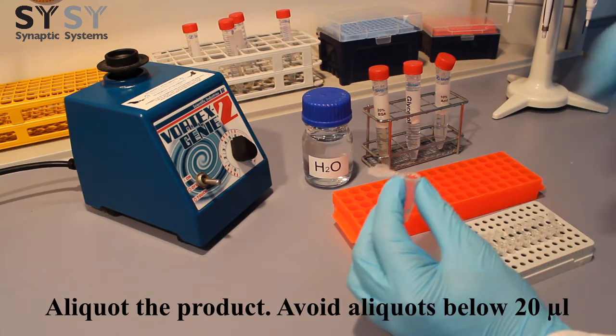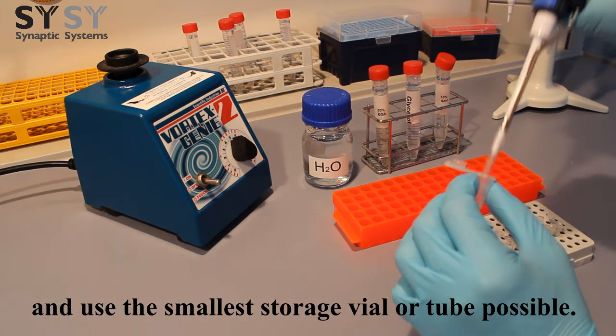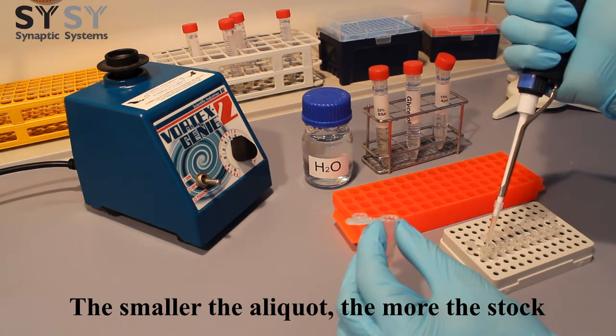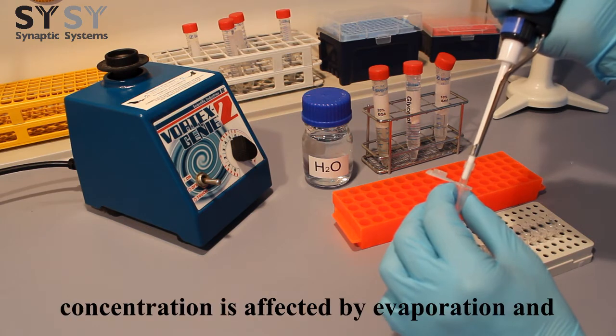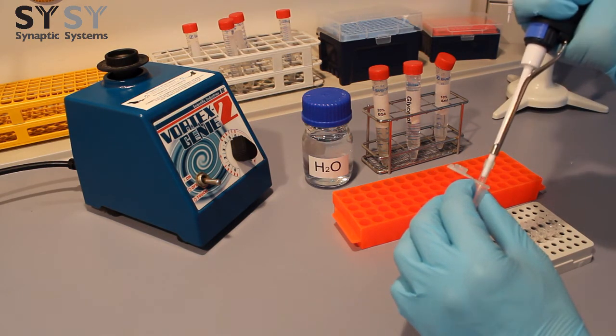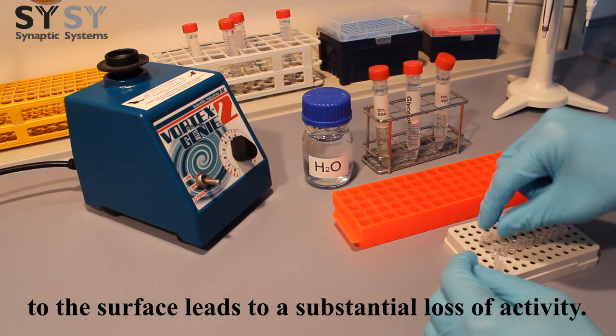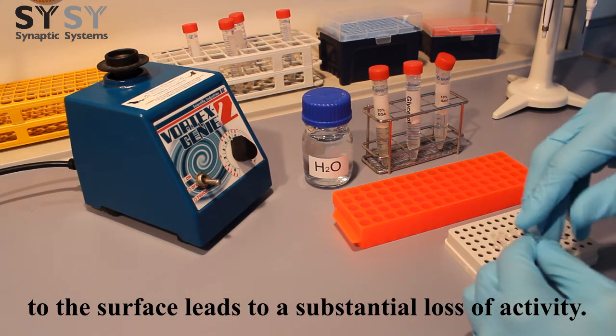Aliquot the product. Avoid aliquots below 20 microliters and use the smallest storage vial or tube possible. The smaller the aliquot, the more the stock concentration is affected by evaporation and absorption of the antibody to the surface of the storage vial or tube. Absorption of the antibody to the surface leads to a substantial loss of activity.